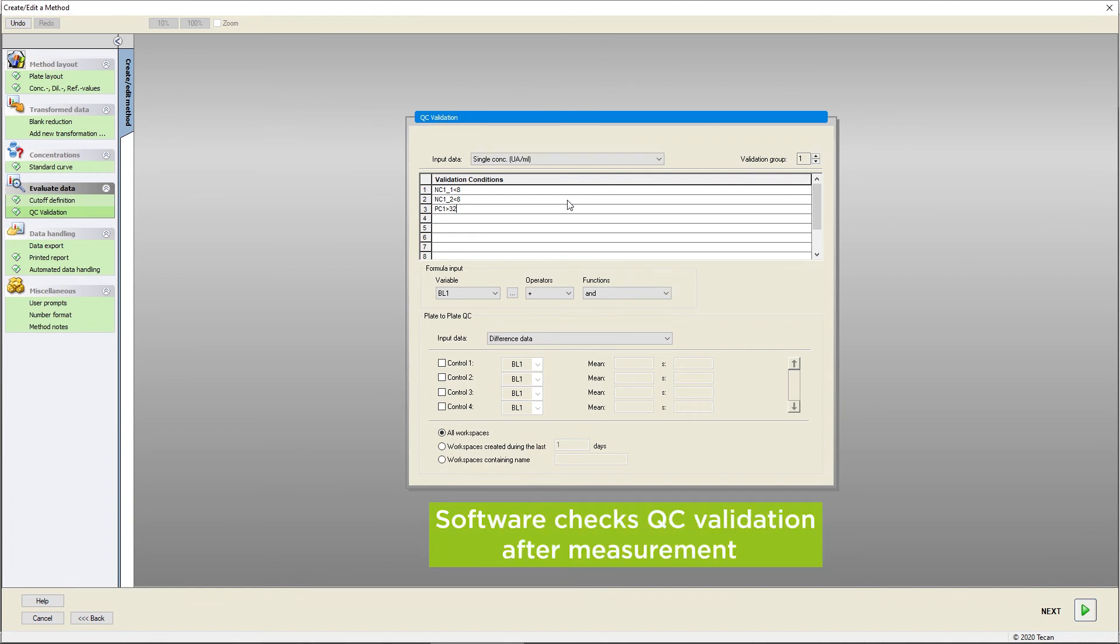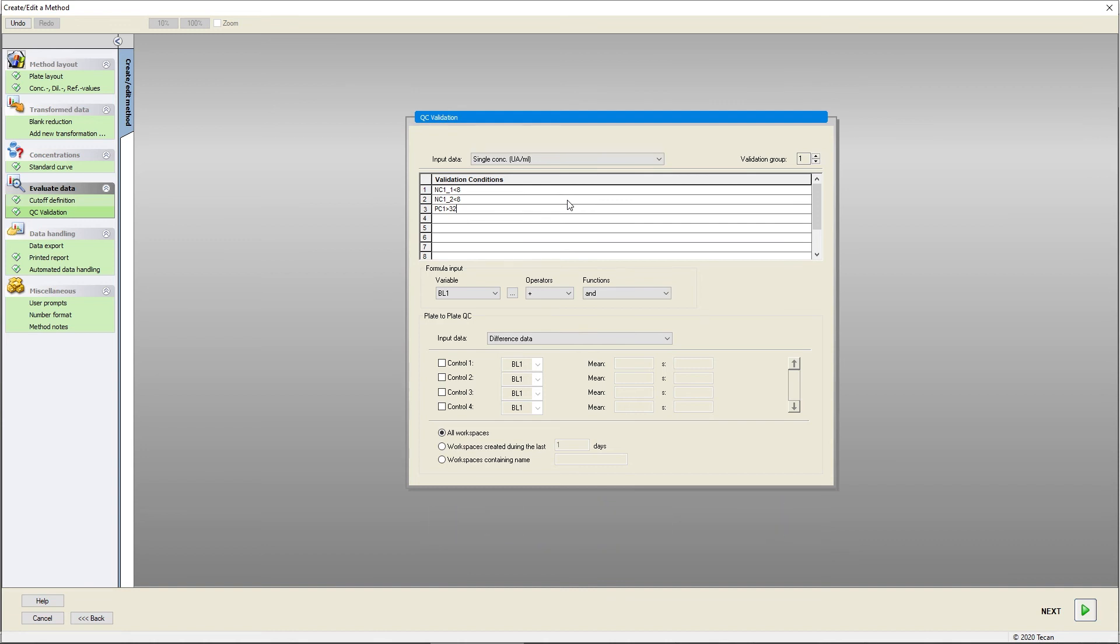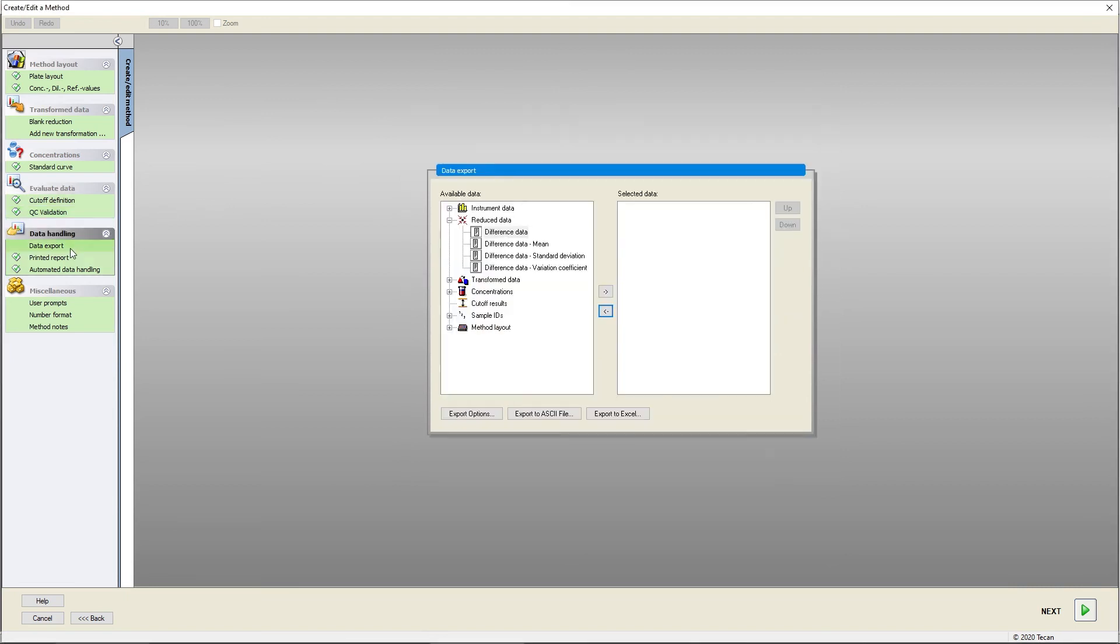In case one criteria is not fulfilled, there will be a corresponding message. To enable exports of your data in ASCII or Microsoft Excel files, select the relevant datasets in the export menu.